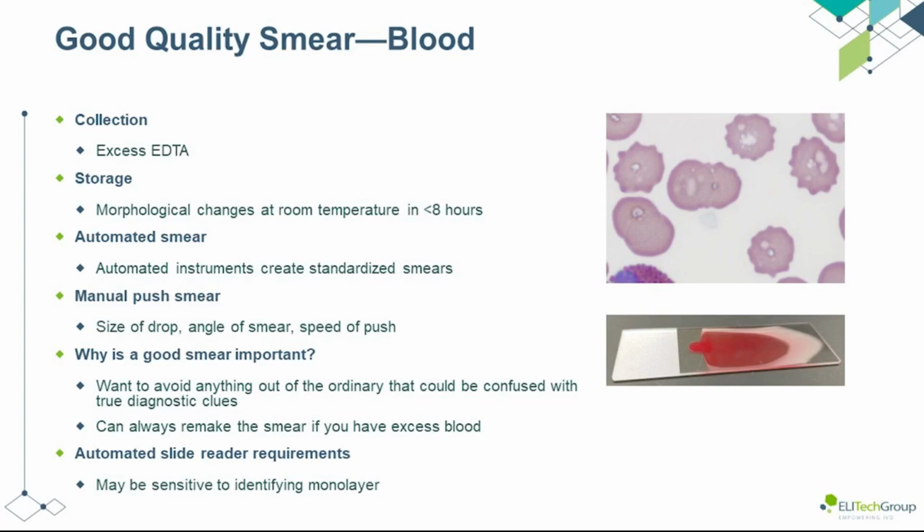If you've made blood smears before, you know that without practice, it can be difficult to consistently give perfect smears. If you work in a large enough laboratory, perhaps the instrument makes the smears for you. But there's also really helpful benchtop devices that can perfectly make consistent slides every time. I'd suggest getting one of these if making smears by hand is a problem.